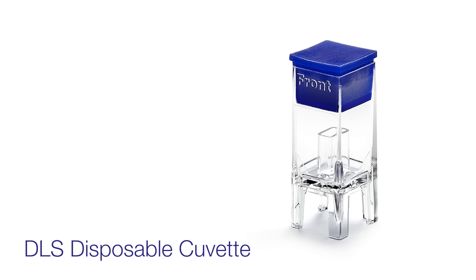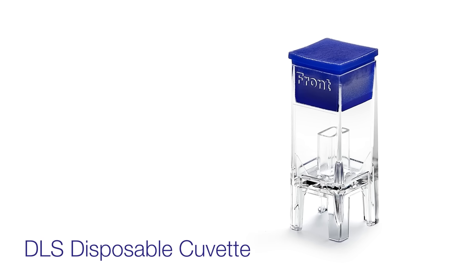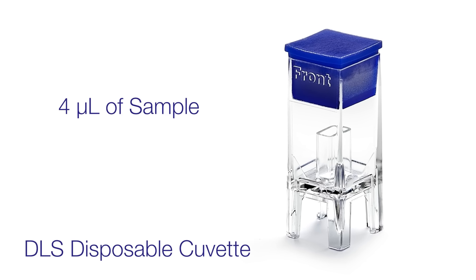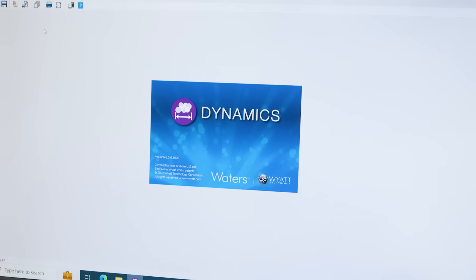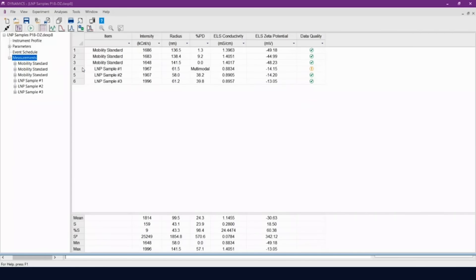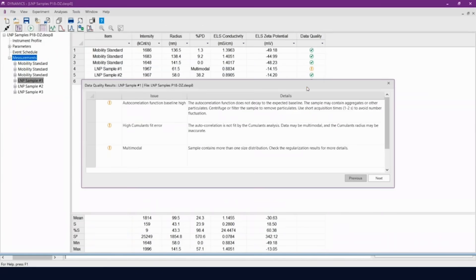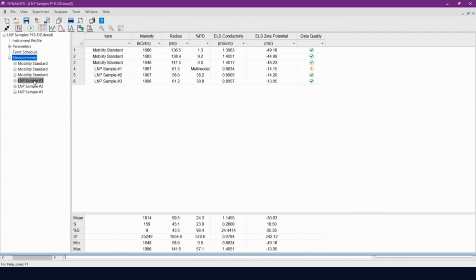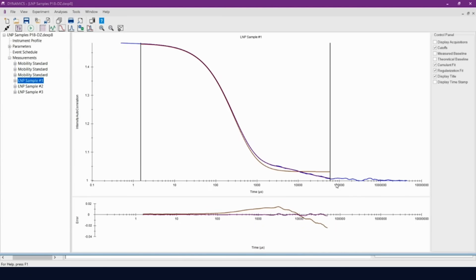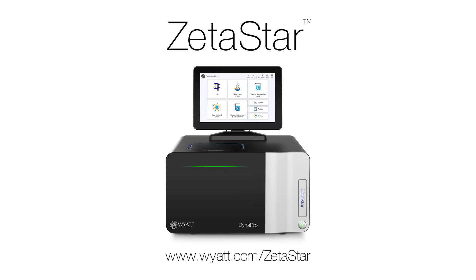Disposable microcuvettes require as little as 4 microliters for size determination by dynamic light scattering. The dynamic software automatically assesses the quality of your data and, when necessary, provides actionable feedback for improvements so you can be confident in your results. The new ZetaStar — automation, speed, and simplicity unprecedented in nanoparticle characterization.